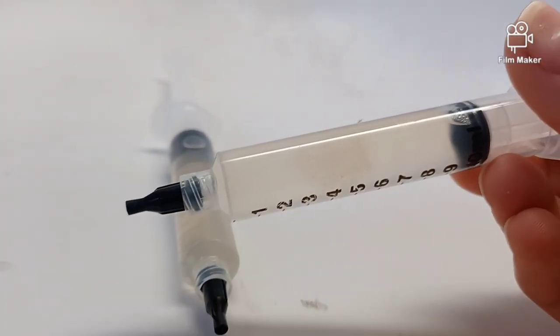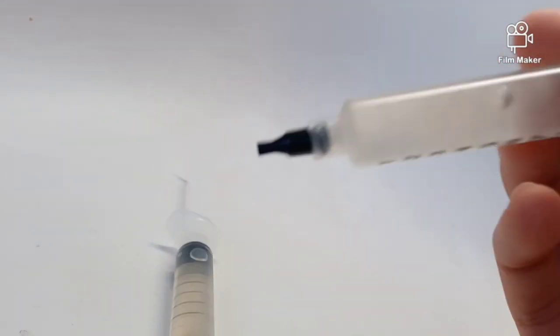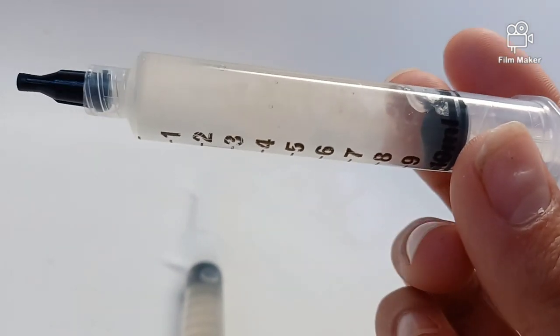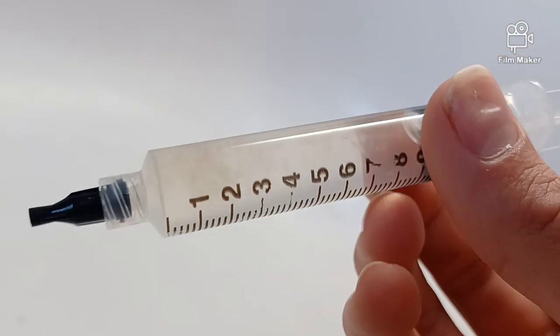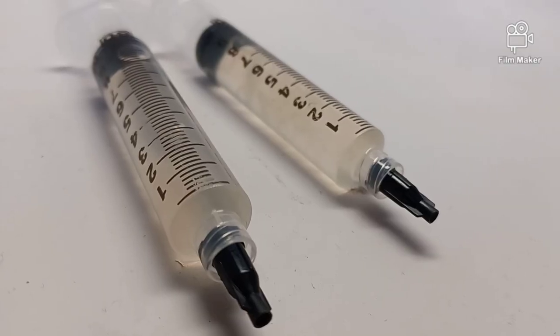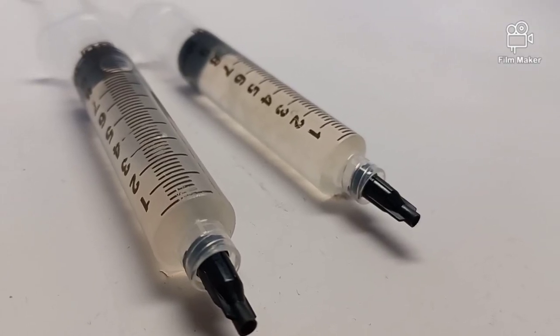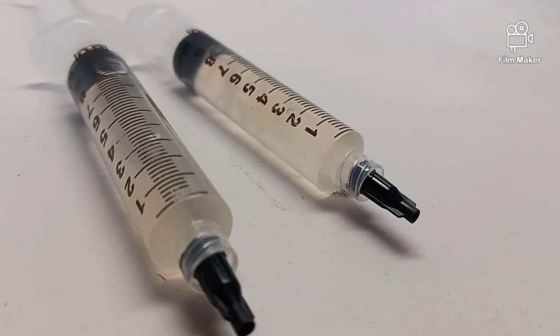This is a Blue Oyster. This is a Reishi syringe. These can be stored in the fridge for up to a year or even more.